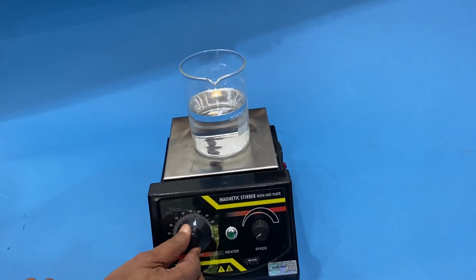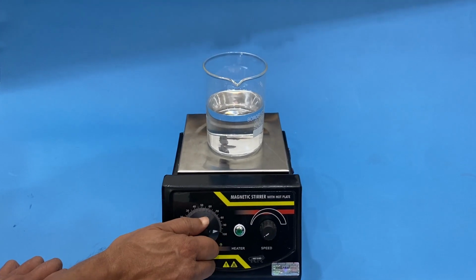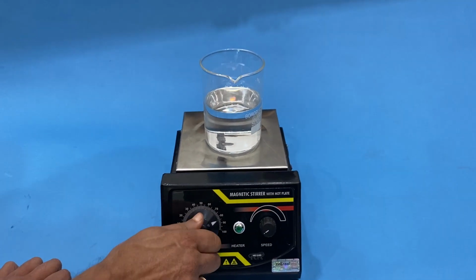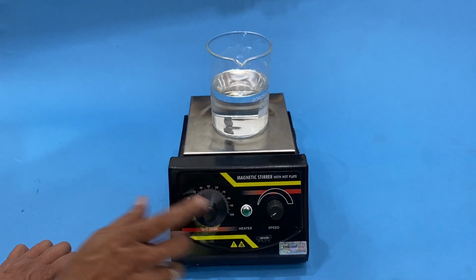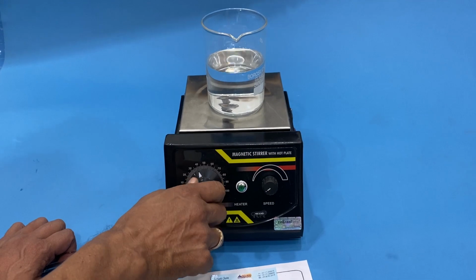30 to 60, 70, it is faster. 60 to 90 is very fast. At 100, it does not stop, so better don't use the 100. Always remember, this is not a thermostat, this is only an energy regulator. It will regulate the speed of the heating.